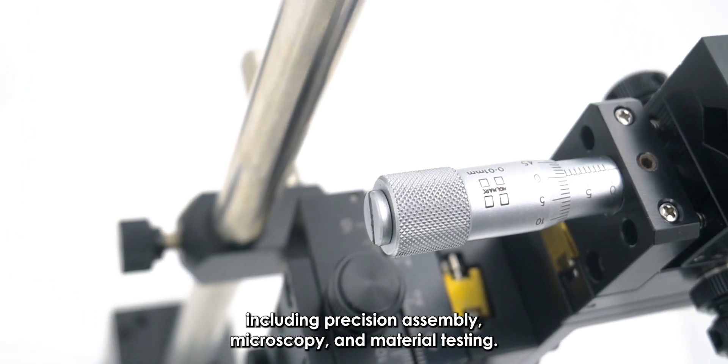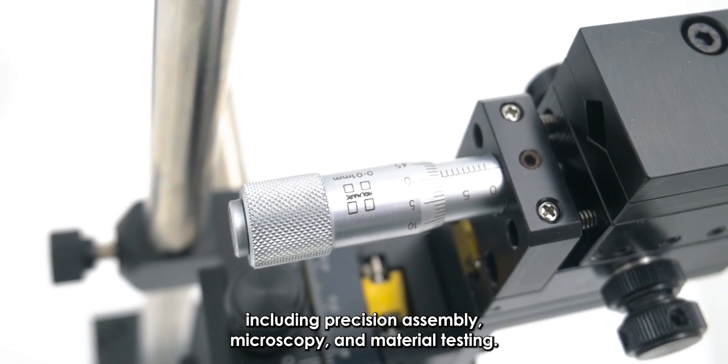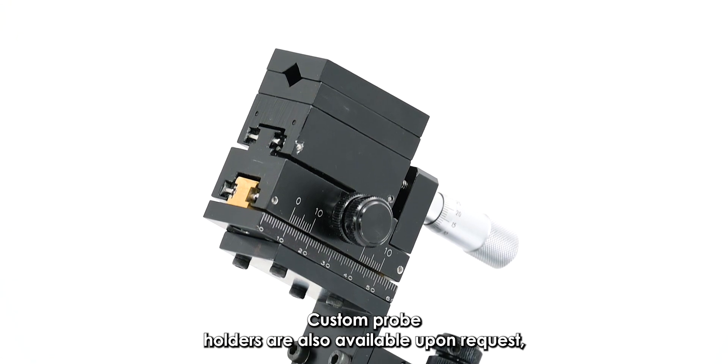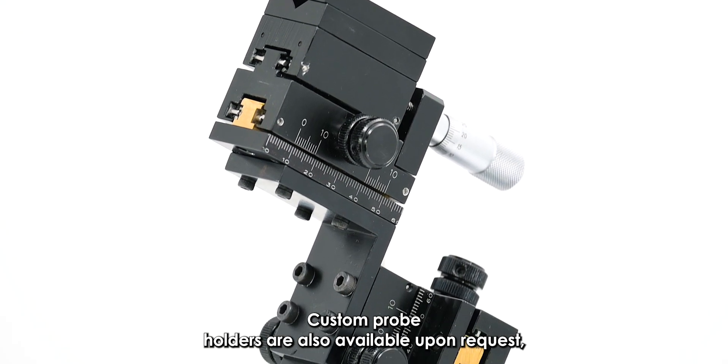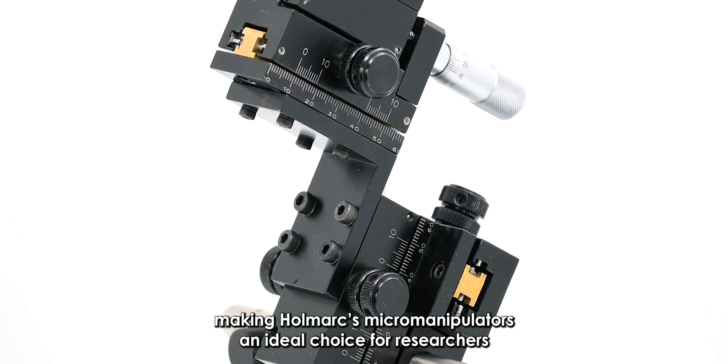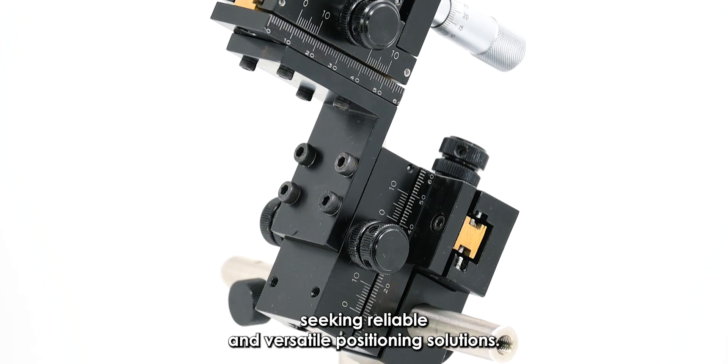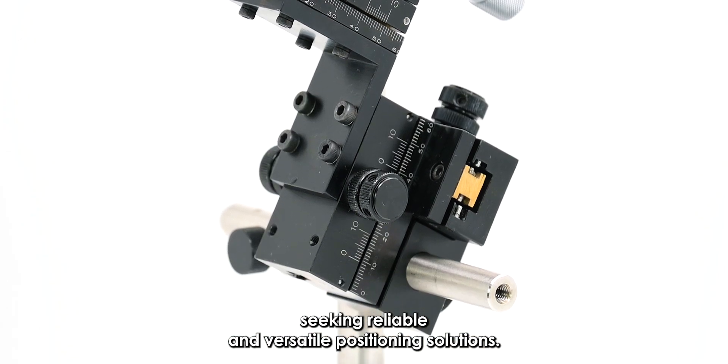Including precision assembly, microscopy, and material testing. Custom probe holders are also available upon request, making Holmark's micro manipulators an ideal choice for researchers seeking reliable and versatile positioning solutions.